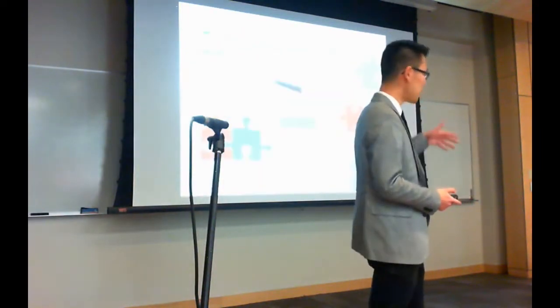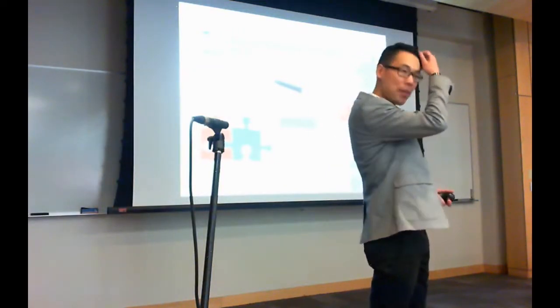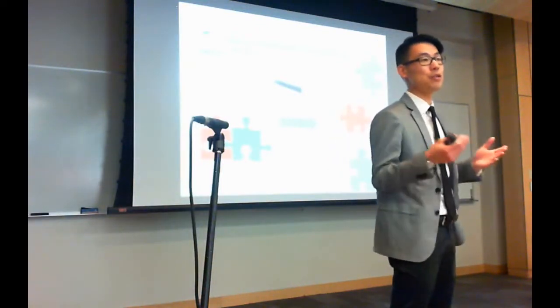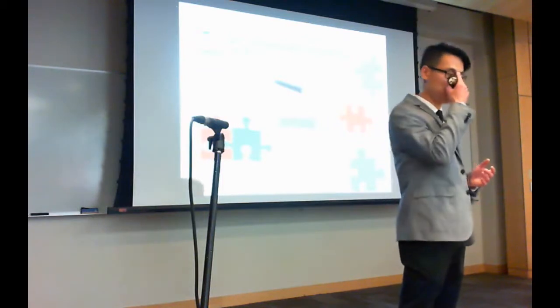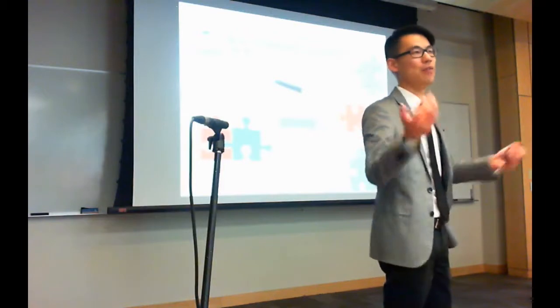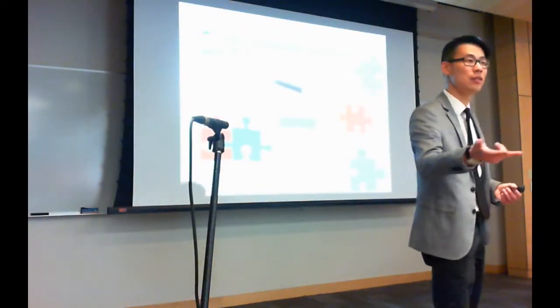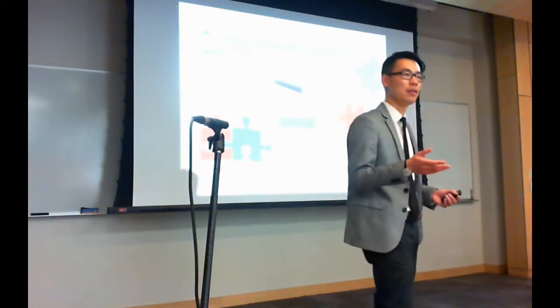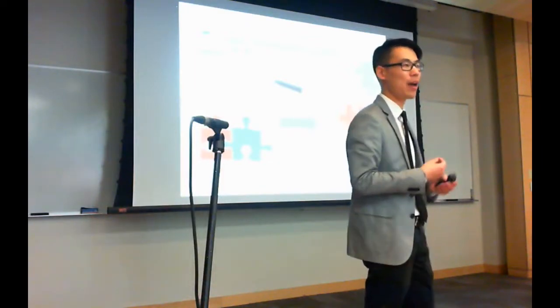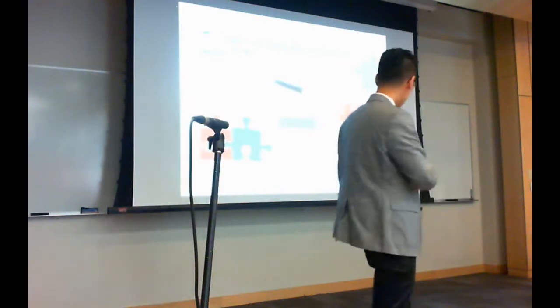Just to give you a little background on the kind of data that we're looking at and what a mass spectrometer is, it's essentially a very fancy, very expensive scale, a scale that you use to measure the mass of molecules. You can weigh each of these molecules. It'll tell you it's however many Daltons. And that might tell you the number of nitrogens, carbons, and hydrogens in that molecule. But that's not enough. We want to know how these molecules are actually arranged, and that tells us information about how it can interact with the rest of the system, the chemistry.